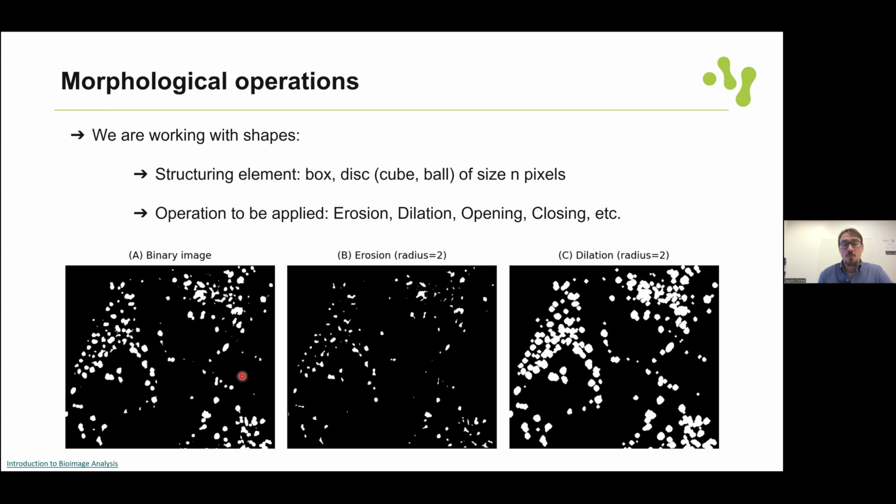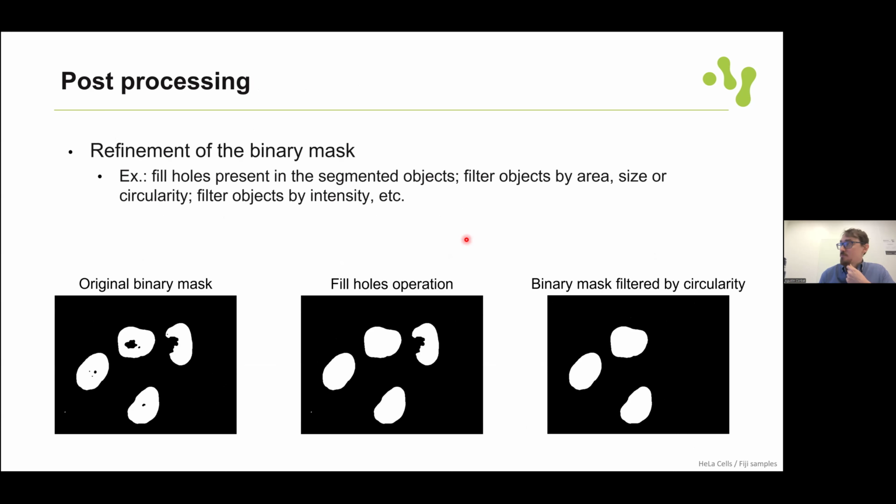Sometimes you spend hours combining an erosion to get rid of the small things, then a dilation to try to fix what you just eroded, and then you think, oh no, but I would like to connect some stuff that was not segmented properly because I was missing some things. Yes, it is a handcraft.